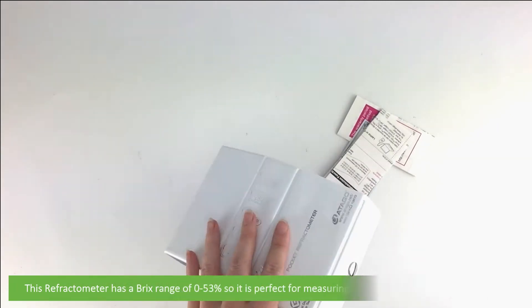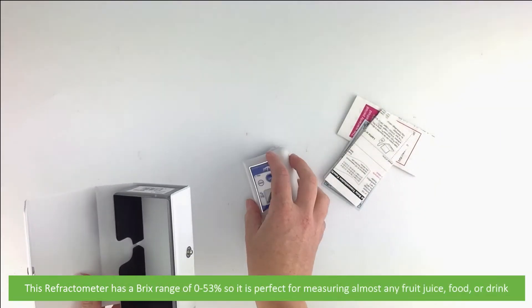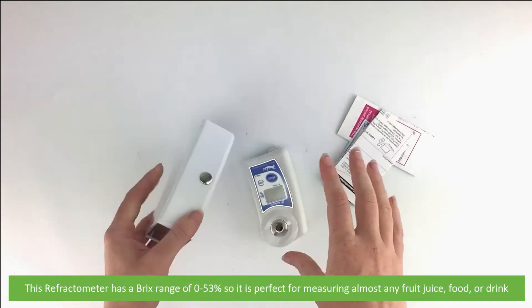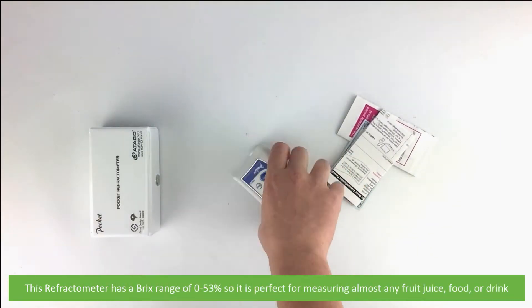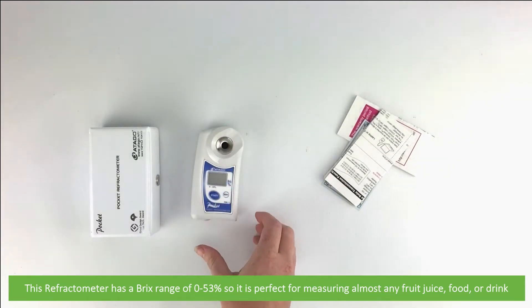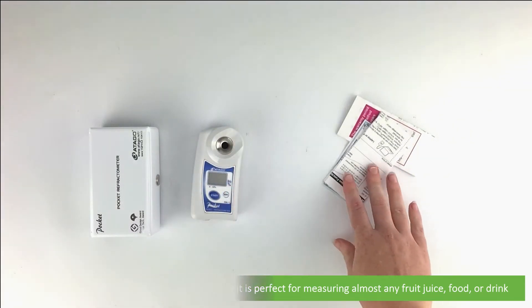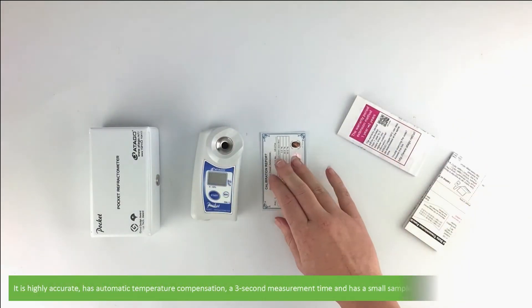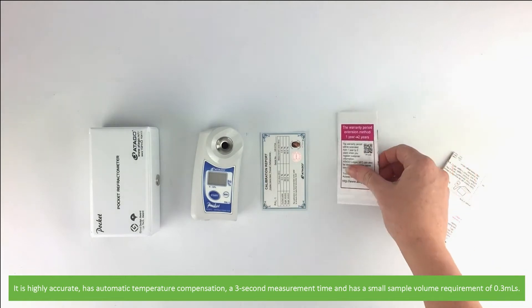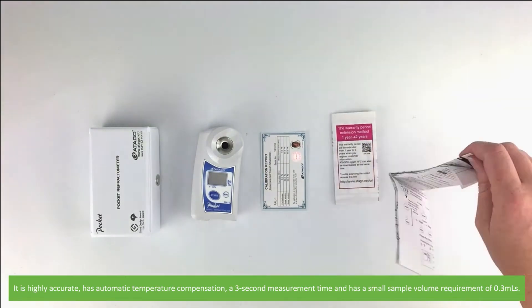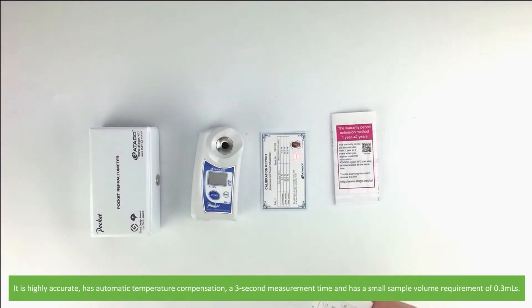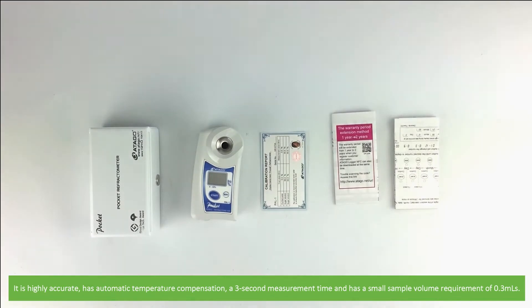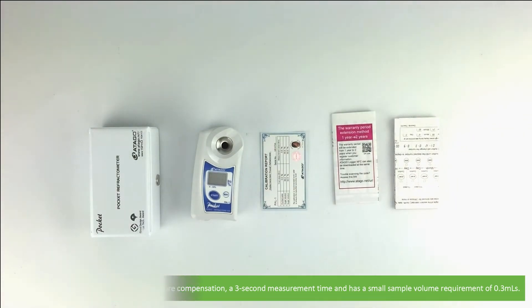This refractometer has a Brix range of 0 to 53%, so it is perfect for measuring almost any fruit juice, food, or drink. It is highly accurate, has automatic temperature compensation, a 3 second measurement time, and a small sample volume requirement of 0.3 mils.